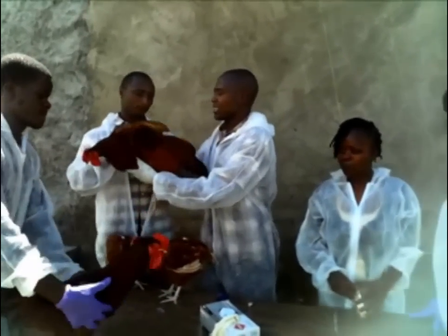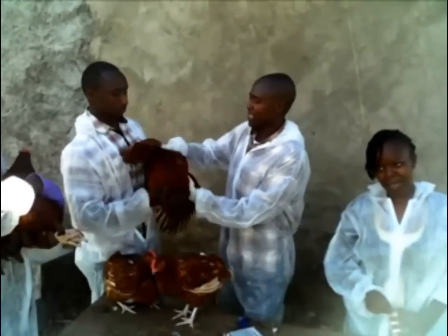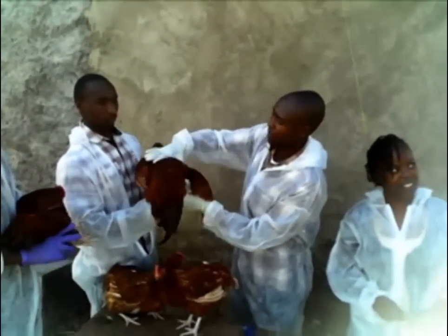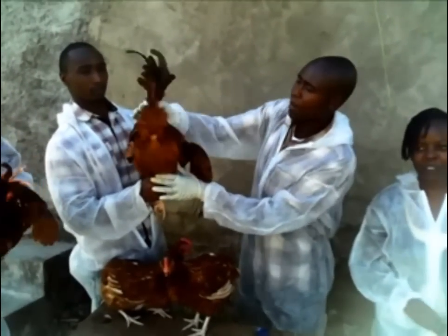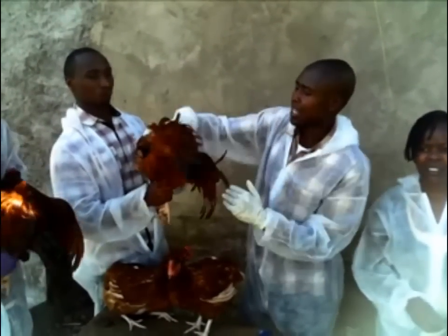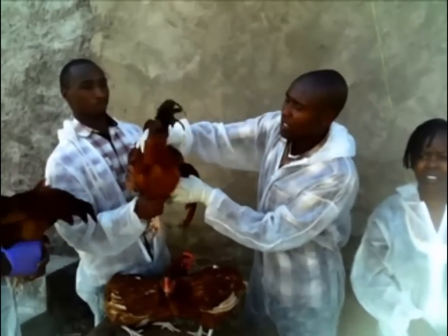You hold your cocks like this, facing you, and then you start cycling from the abdomen towards the back. While you are at the tail, make sure you hold the tail upwards and towards the head. You do this several times to make sure that the cocks is stimulated.